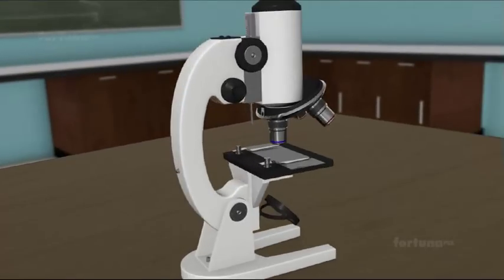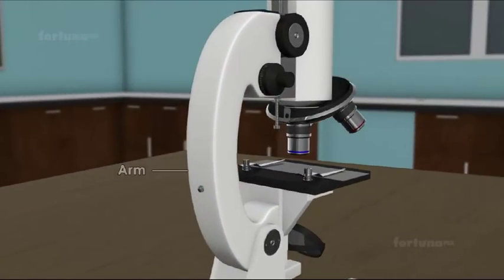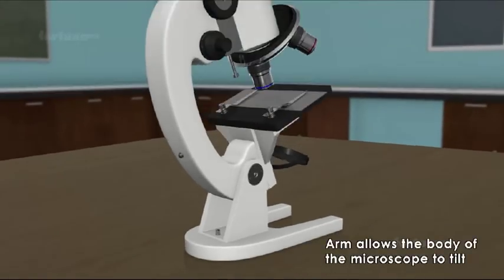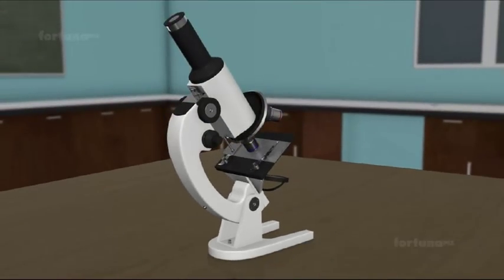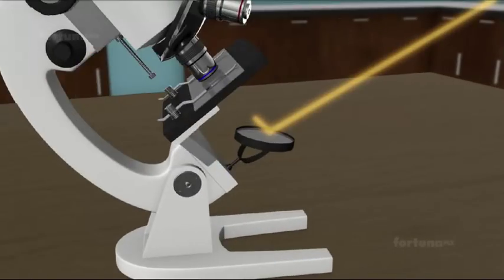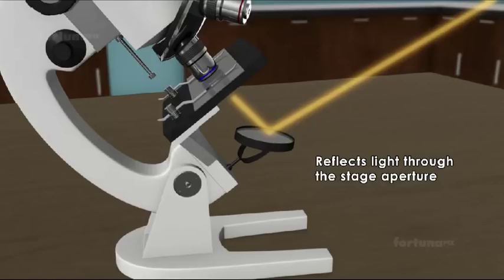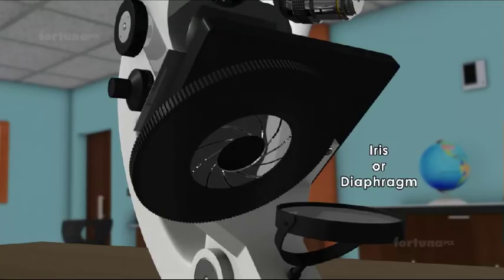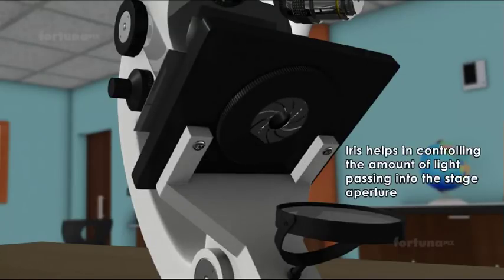The body tube is arranged on an arm which is connected to a strong base. This arm allows the body of the microscope to tilt. A small mirror at the base of the microscope reflects the light through the stage aperture. Above the mirror, an iris, also known as a diaphragm, is present. Iris helps in controlling the amount of light passing into the stage aperture.